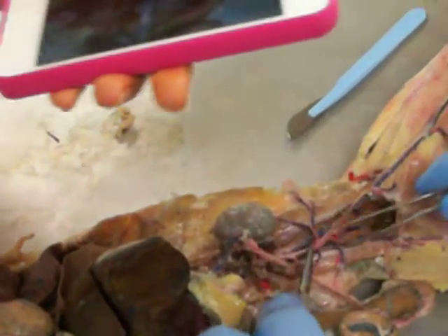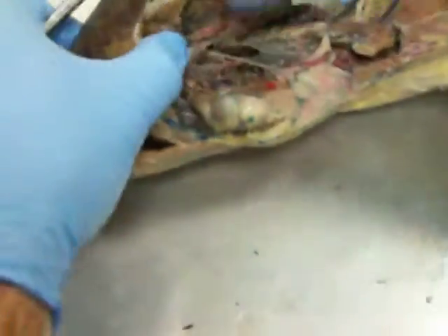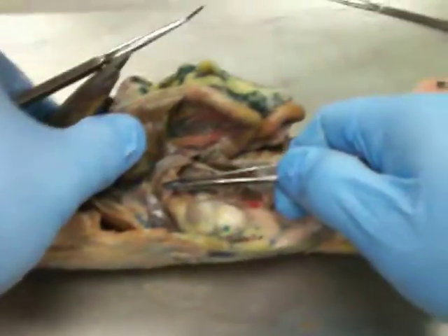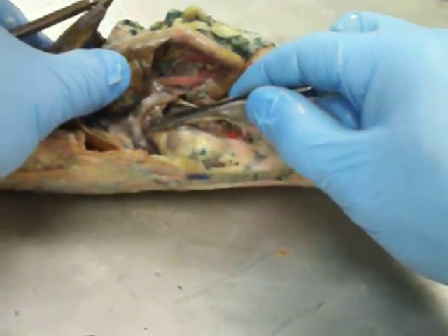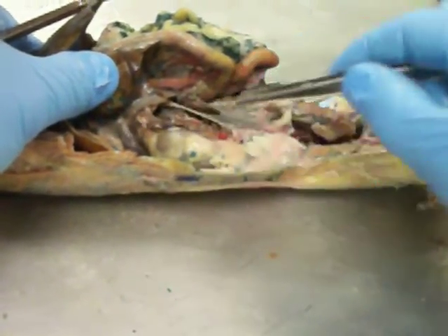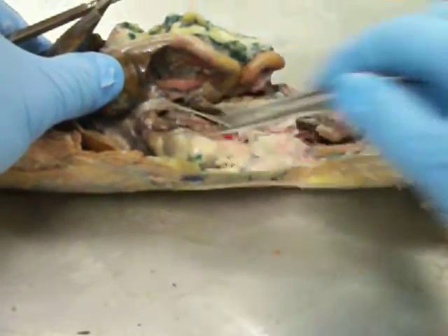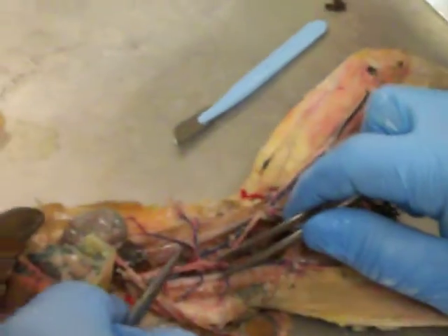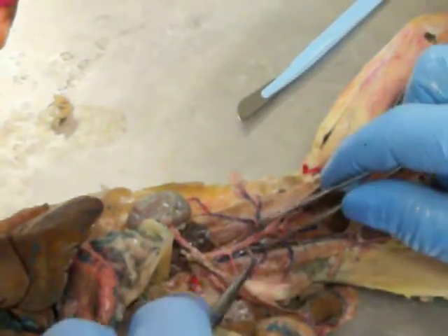What about the adrenal lumbar? Where is that again? Well, I'm going to have to find that on a different cat. It's not too clear on this cat. Actually, on this side, there's your adrenal gland right there. And there's your adrenal lumbar artery, and there's your adrenal lumbar vein. Okay. So that works. Okay, and I can pull that out a little bit more. Alright, back over here, this is our adrenal lumbar vein.